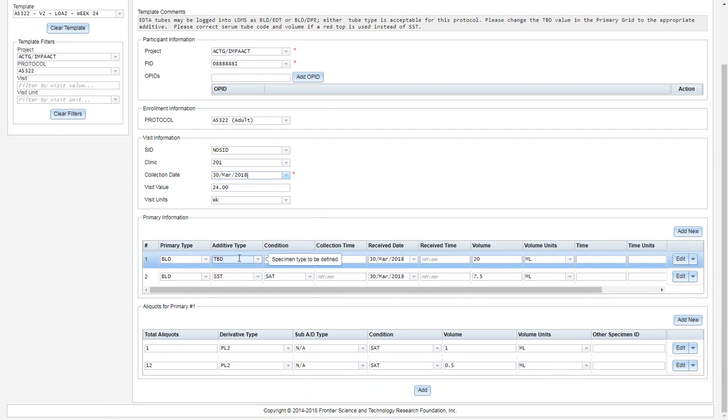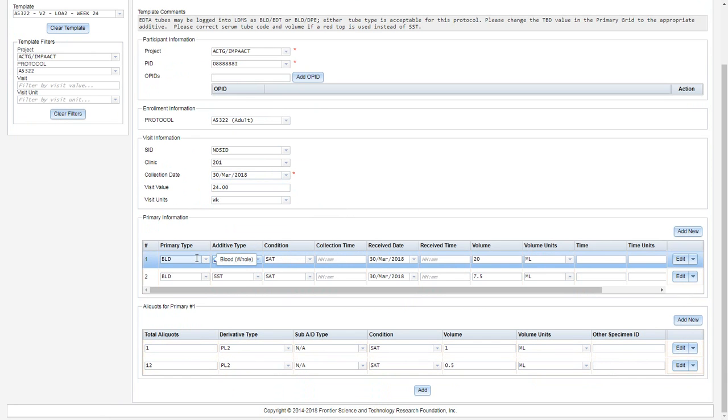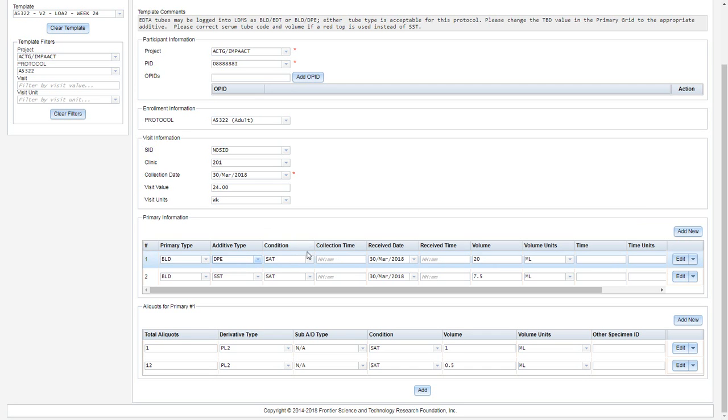In primary number one, we see additive TBD, and this means that the specimen type is to be defined. If we review our comments above, we can see what additives are acceptable for this specimen. I must enter my collection time. This is a 24 hour clock, and you must enter the colon.